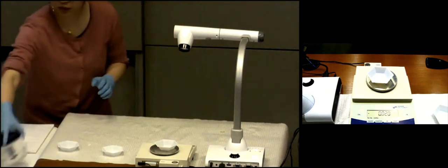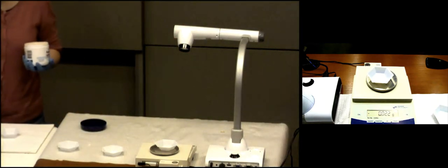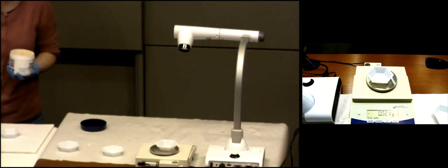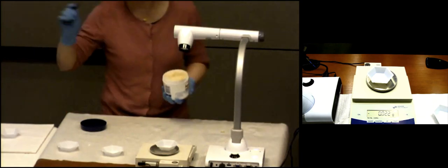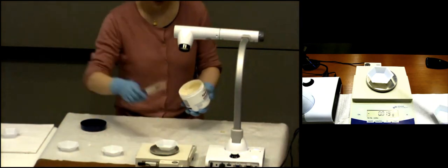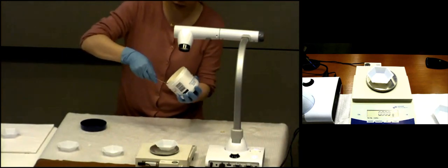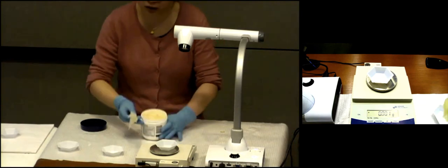The next one we're going to measure is Aquaphor. So I'm not going to use the scoopula here because it's dented, curved. It's harder to clean. I'm going to use a spatula to measure it. All right, and what is my target weight here? 30.525. Okay.